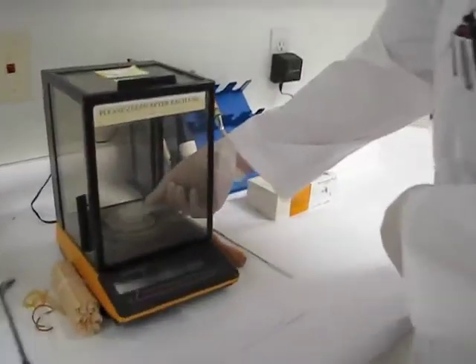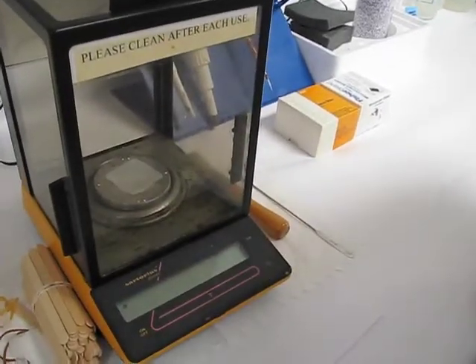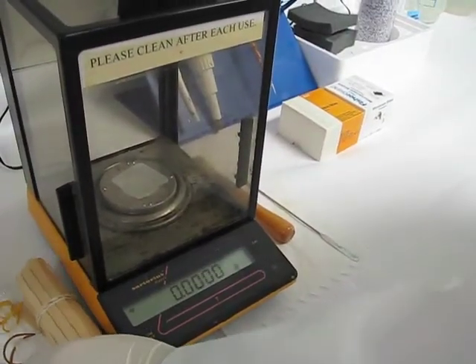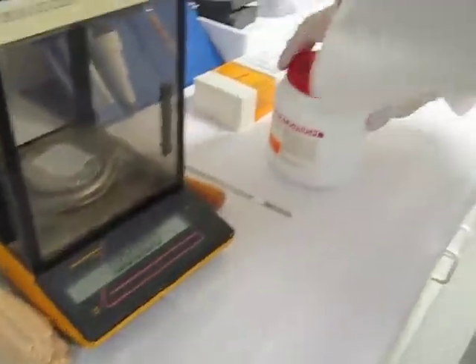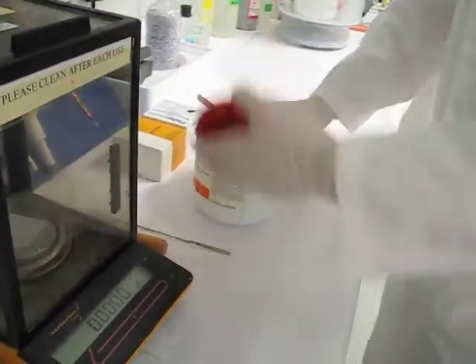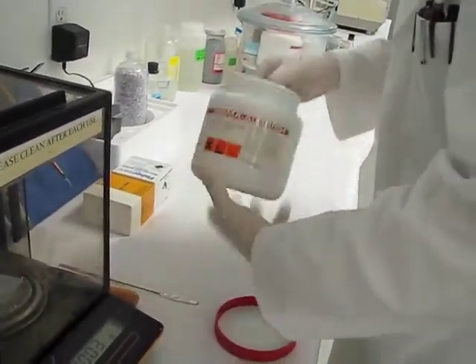I've got the balance, and I'm going to take a little tray and zero out the tray until it reads zero. Then I'll open this. And of course, always use gloves no matter what you're working with — that's a standard practice.